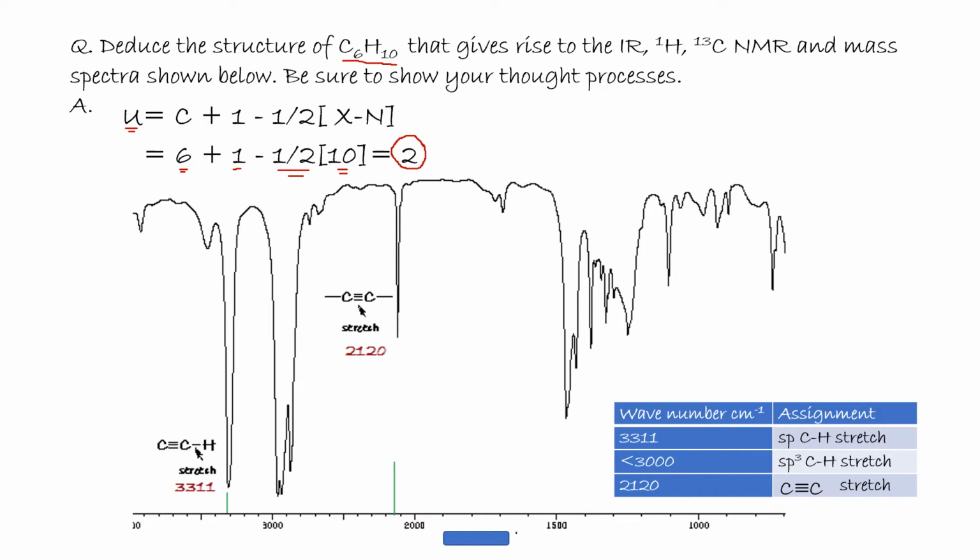From the IR, we have here a peak at 3311, a very sharp, strong peak. Another one, sharp but medium, at 2120 cm-1.